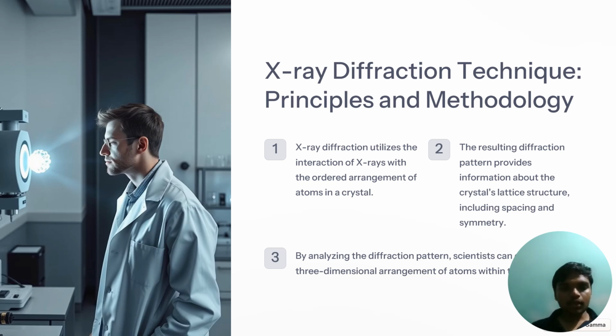Data collection. The diffraction pattern is collected on a detector which captures the angle and intensity of the diffracted rays. This data is used to generate a series of equations that relate the diffraction angles to the positions of atoms in the crystal.